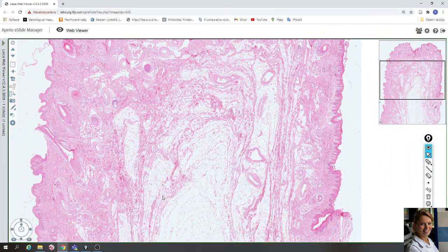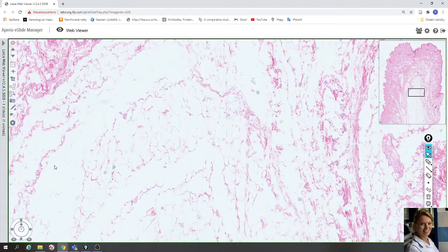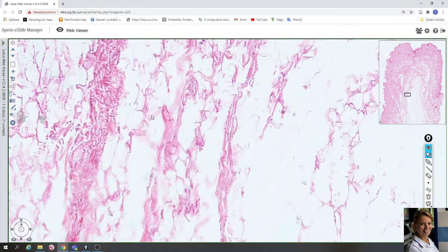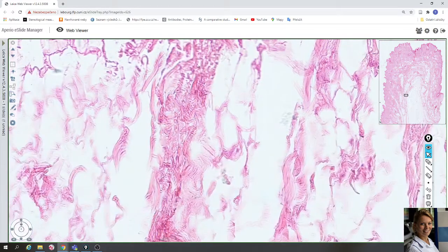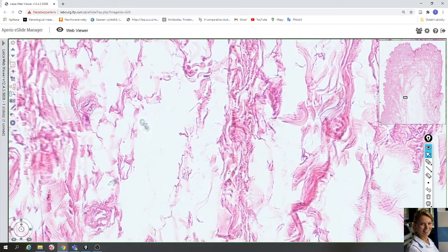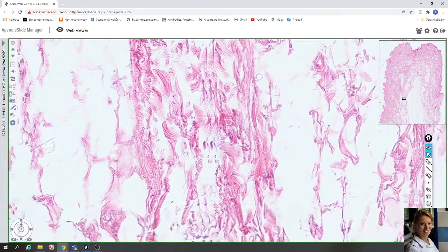The core of Labia Majora contains connective and adipose tissue. You can see a lot of adipocytes in the center of Labia Majora. Also collagen fibers and fibroblasts and fibrocytes, which produce fibers and extracellular matrix. Here is the nucleus of a fibrocyte, also here, and pink collagen fibers.